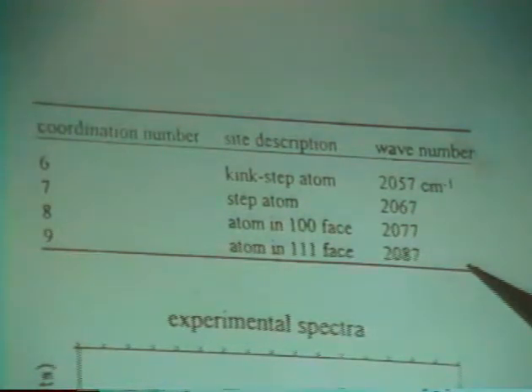So we're going to apply this to the small particle, and our model particle is 11 angstroms in diameter, which has a very nice shape. In fact, most of the atoms in that molecule are corner atoms. If I cover that little crystal with CO molecules spaced square root of 3 times a platinum diameter apart, you can get 12 molecules on it, all of which are on the corners.